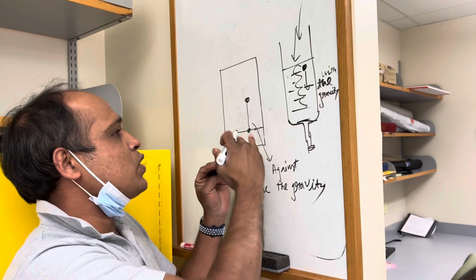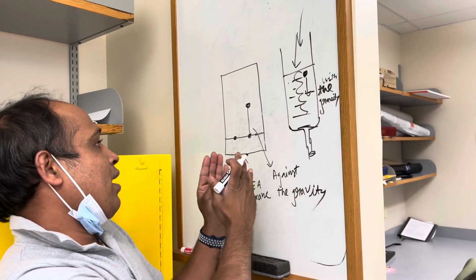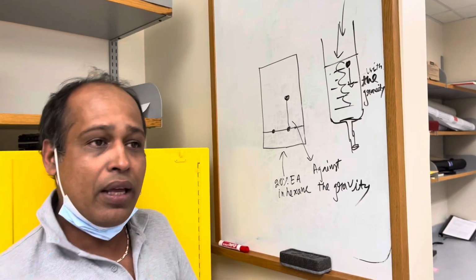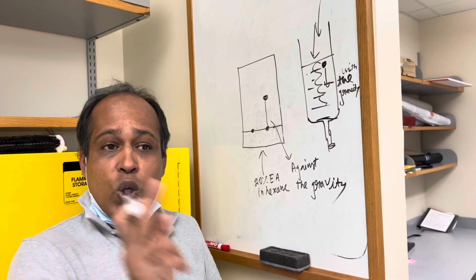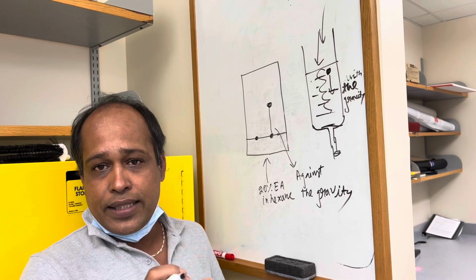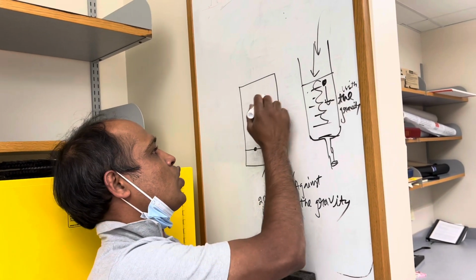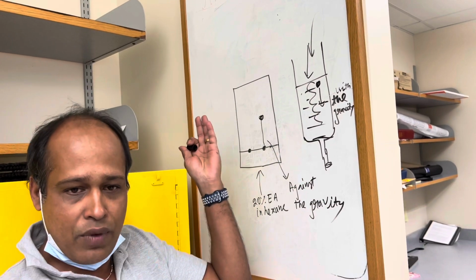And that's why sometimes you can be misguided, like why it is showing like this, and in my column everything is coming up. First question, in your first TLC, when you compared your starting material and the crude, you saw no spot on that.